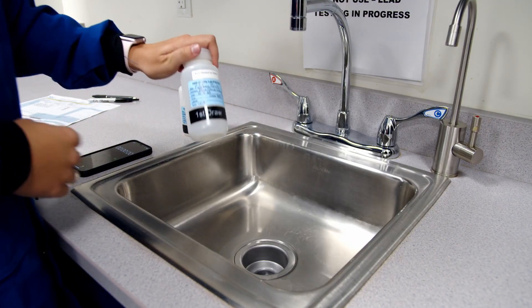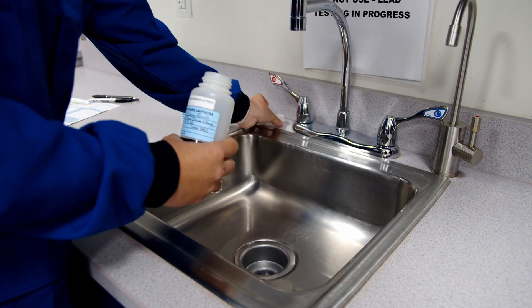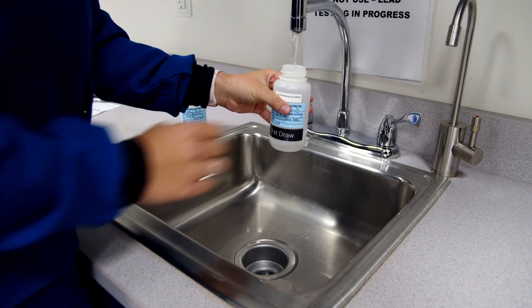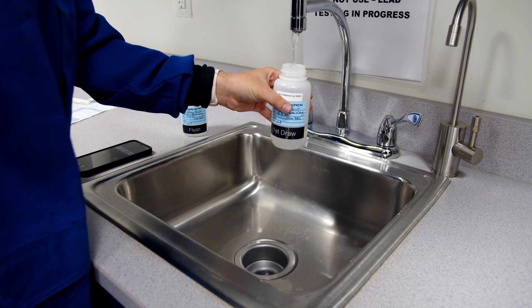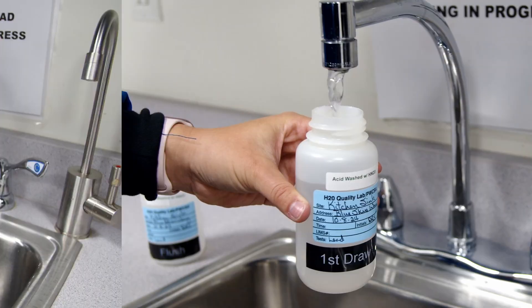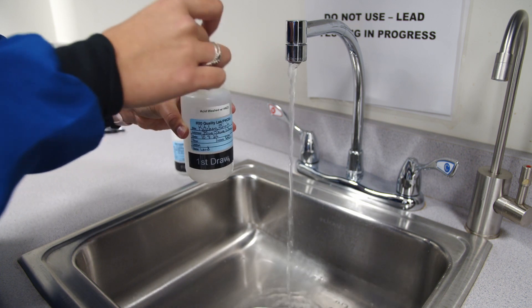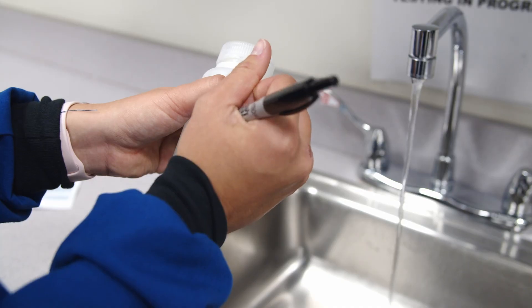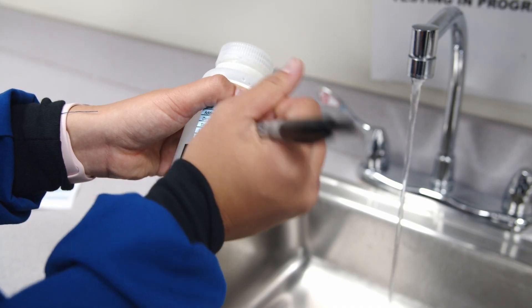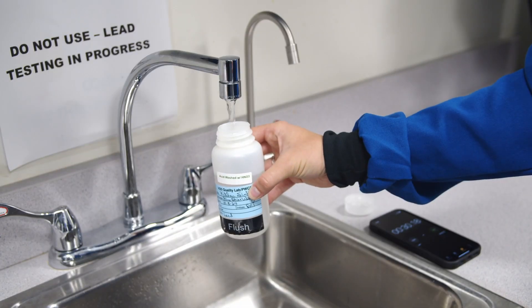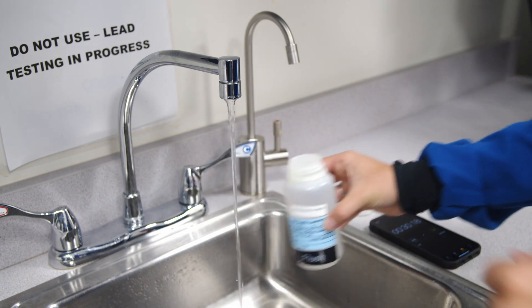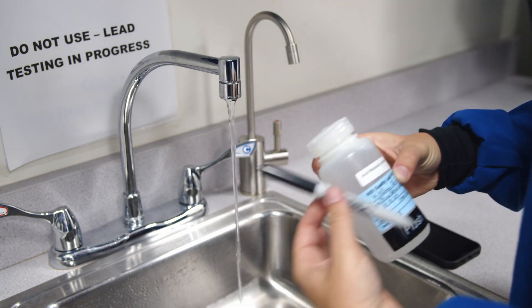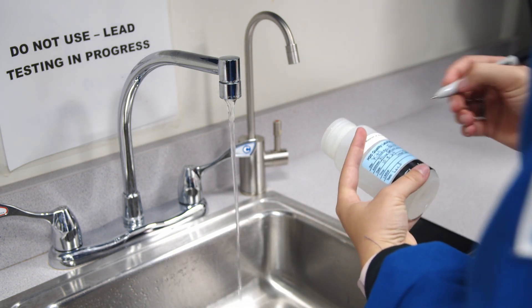When you are ready to take the sample, remove the cap from the bottle you have labeled as the first draw and set it aside with the inside of the cap facing up. Position the bottle under the faucet. Slowly turn on the cold water and fill the bottle to the neck. Carefully screw the cap back on the bottle, making sure the cap is secure, and set your timer for 30 seconds. Document the time of the collection on the first bottle during this time. After 30 seconds, collect the flush sample the same way the first draw sample was collected, ensuring the cap is secure. Confirm the bottles have all information documented and the chain of custody matches each set of bottles.